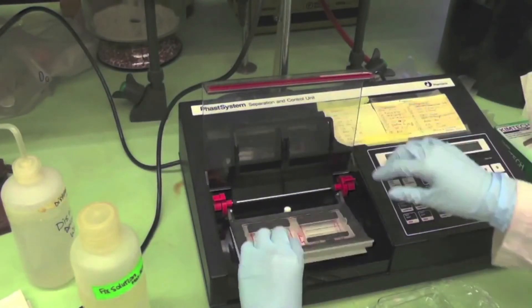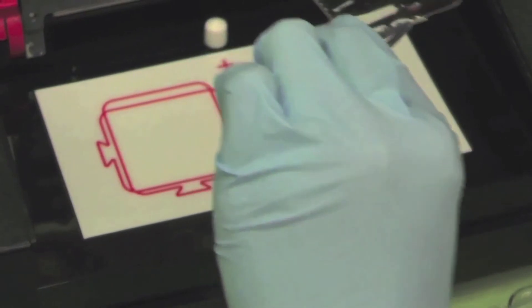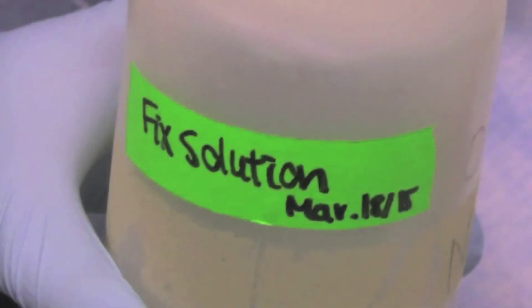Lift the sample applicator arm and electrode assembly so you can remove the gel. Place the gel in a square petri dish, add the fixing solution and leave for 5 minutes at room temperature.